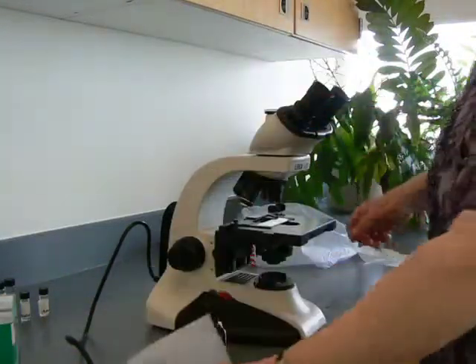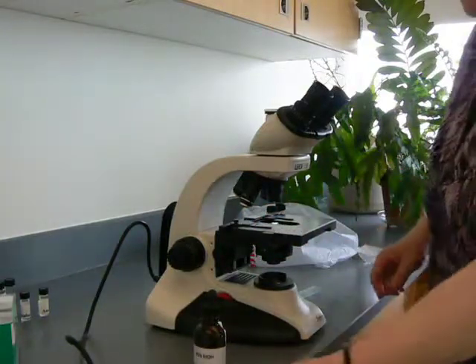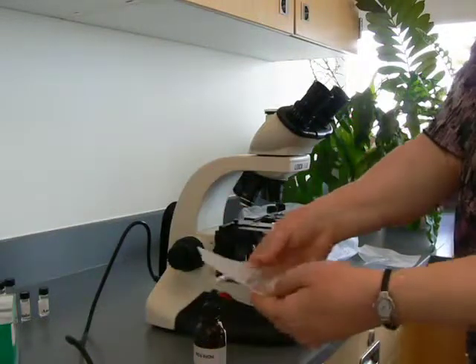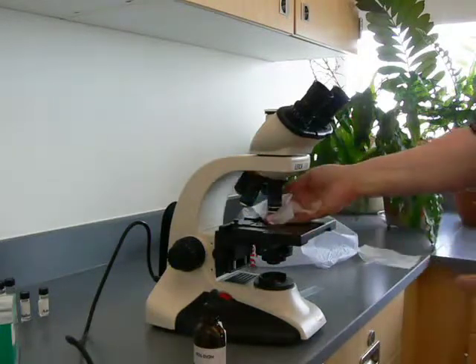They're very expensive. Now you also want to get rid of your slide — you don't want to get oil all over your fingers. Now we put alcohol on our lens paper. It's the all-purpose cleaner. Let's move this back into place.